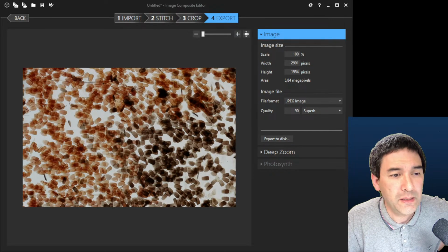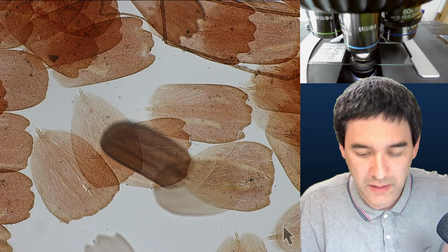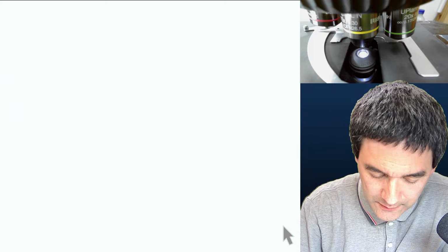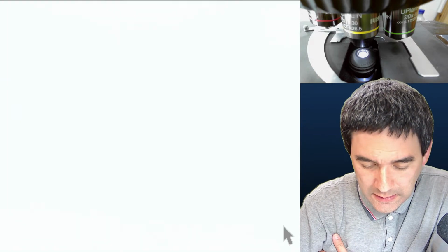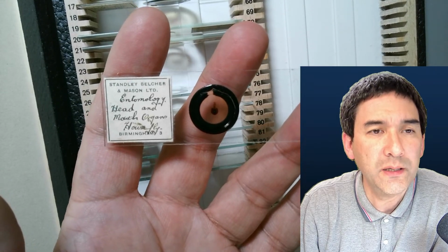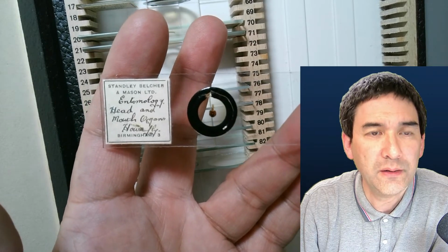So we move on again to the scope view, and let's have another look at the next slide. Always go down a little before exchanging the slide. I always go down with the magnification here. So, we still have a few left. So what is this here? I think I did not make a video of this. Let's have a look. No, that's the wrong one. This one here. The mouth organs of a housefly. Yeah, I think we already looked at this last week already.